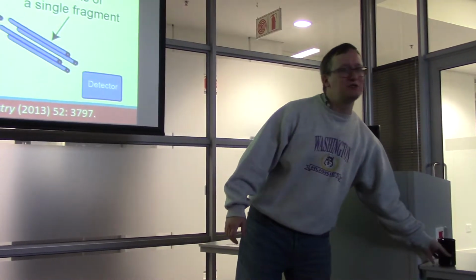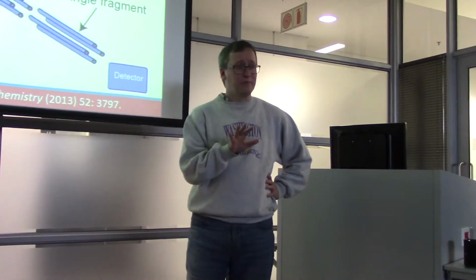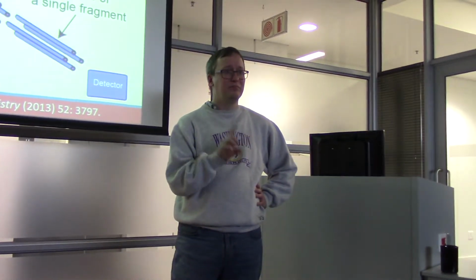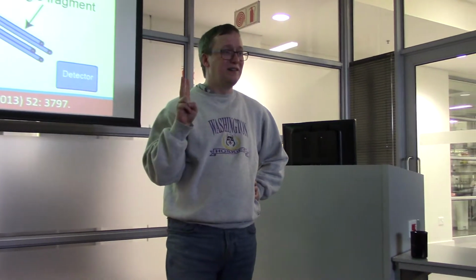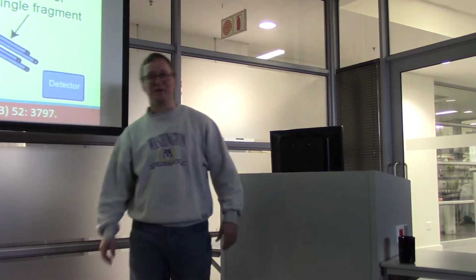Okay, I'll give you an introduction. A triple quadrupole instrument is still a mass spectrometer. And what are the three things all mass spectrometers contain? Ion source. Ion source, very good, yes. Mass analyzer. Mass analyzer is number 2, yes. And a detector. And a detector, brilliant, well done.